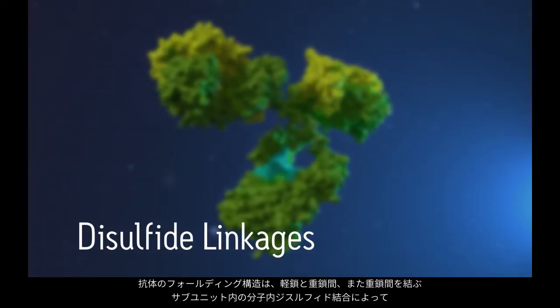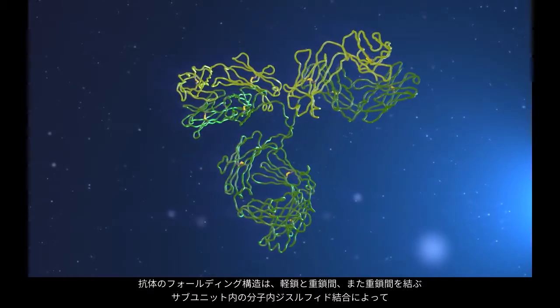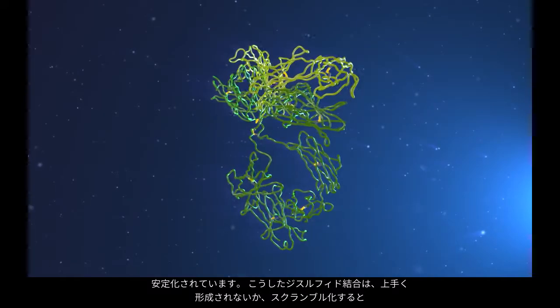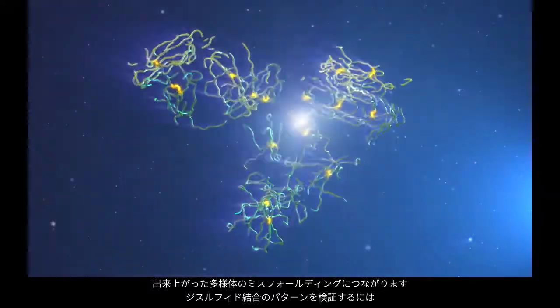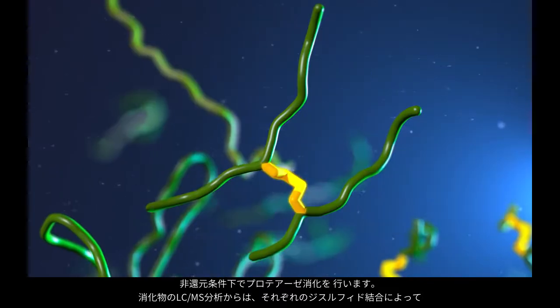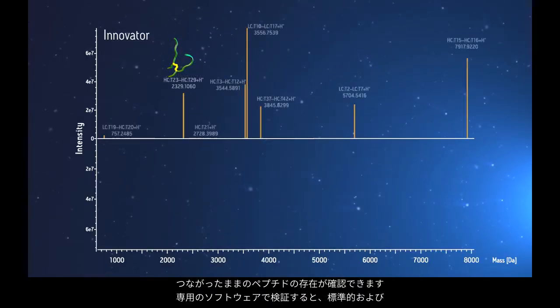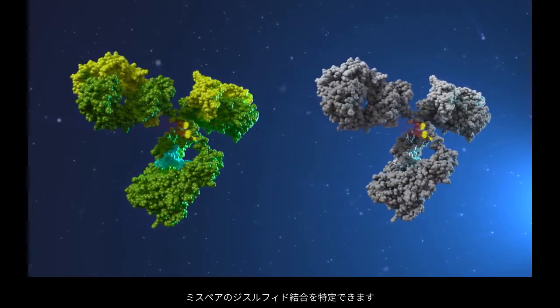The folded structure of an antibody is stabilized by internal disulfide linkages within the subunits, between the light and heavy chains, and holding the heavy chains to each other. These disulfides can be misformed or scrambled, leading to misfolded product variants. The pattern of disulfide linkage can be examined by performing a protease digest under non-reducing conditions. LC-MS of the digest reveals the presence of peptides still joined by their disulfide bonds. Purpose-built software can identify canonical and mispaired disulfide linkages.